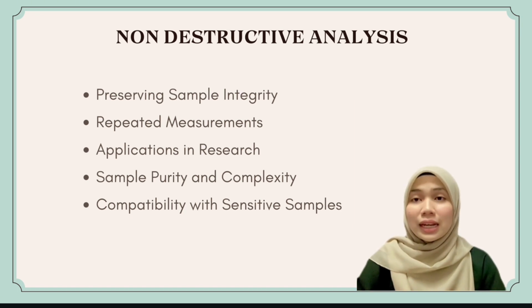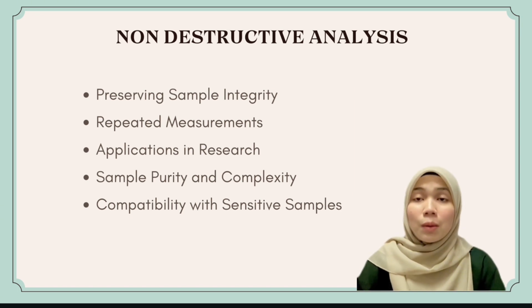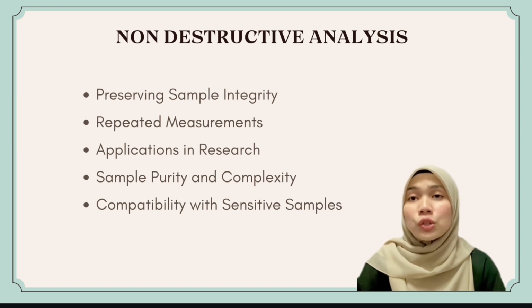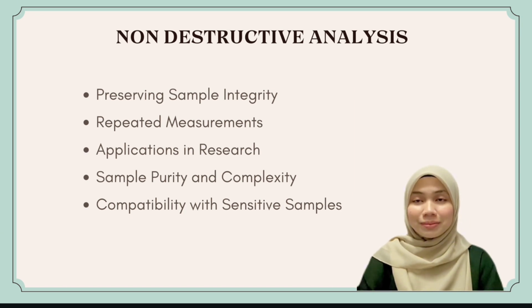In research, especially in biology, NMR's gentle approach enables the prolonged study of a single sample, ideal for experiments requiring numerous measurements over time. NMR ensures the purity and accuracy of sample representation in complex mixtures, crucial for maintaining fidelity in results. Furthermore, its compatibility with sensitive samples, such as those in biology or environmental studies, positions NMR as a valuable tool that investigates without causing any harm, ensuring the safety and integrity of the sample throughout the analytical process.